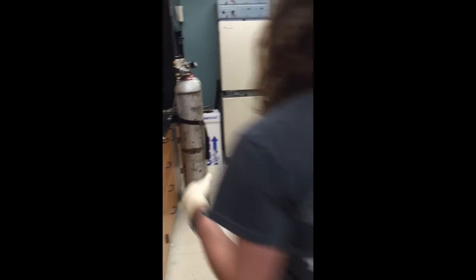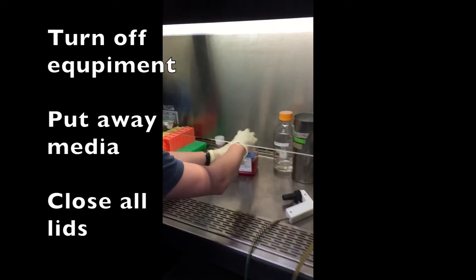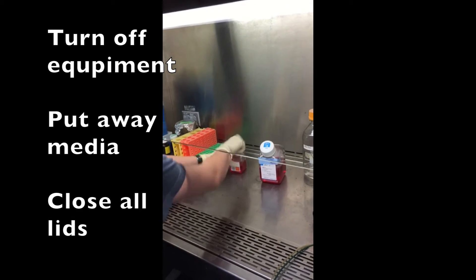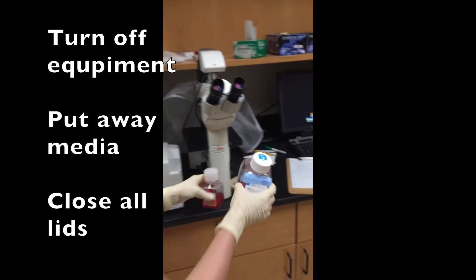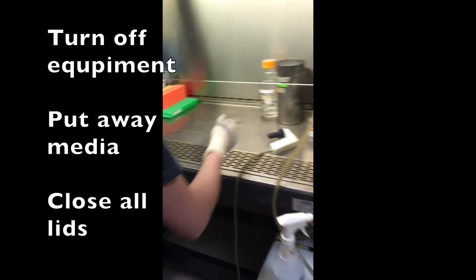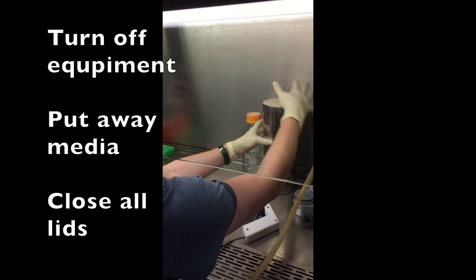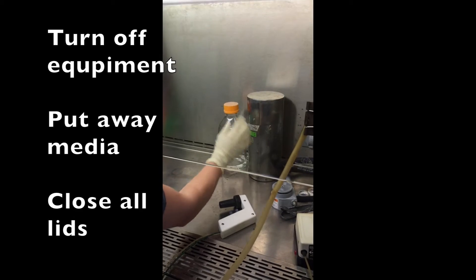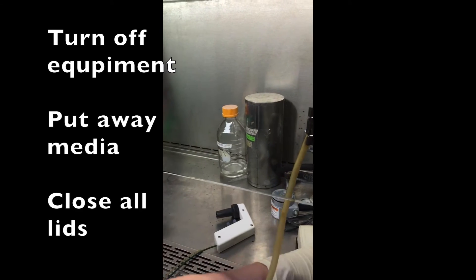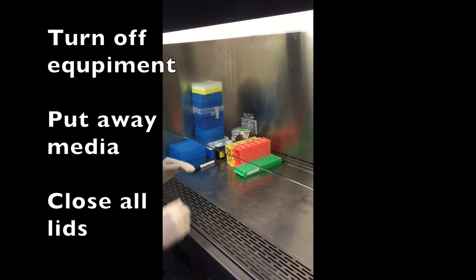Then you want to make sure everything is turned off. In the hood, we'll close all the lids to your media and trips, and we'll put those in the fridge in room 119. Then you want to cover and close that up. It's easiest if you line up the edge right there, close your PBS, turn that off, and make sure everything is all nice and neat again.